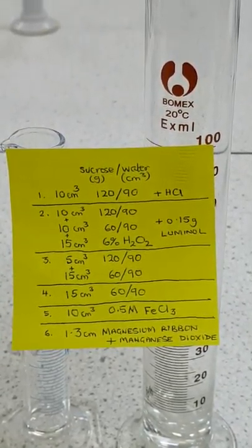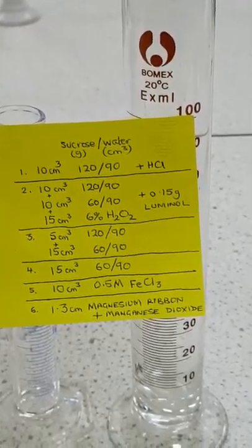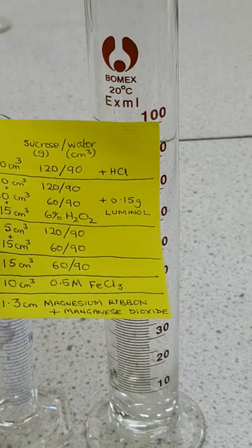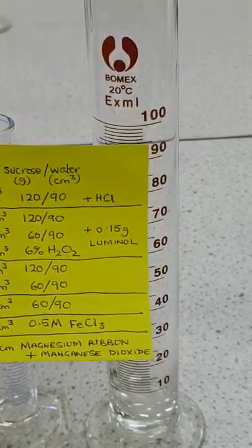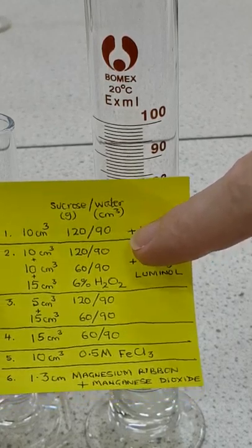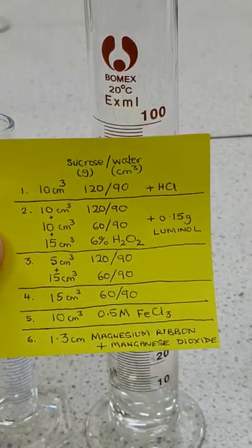Here's a little curiosity for you to look at, and hopefully there will be some interesting chemistry involved. We'll be setting up layers of different solutions in the measuring cylinder here, and you can see the constitution of the layers on the paper, so we'll be following that.